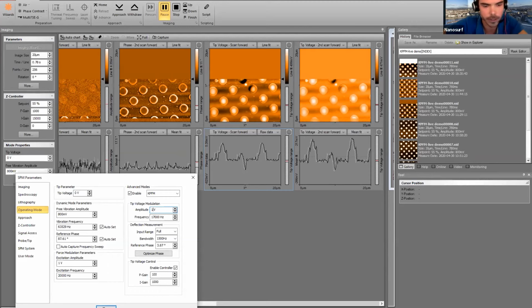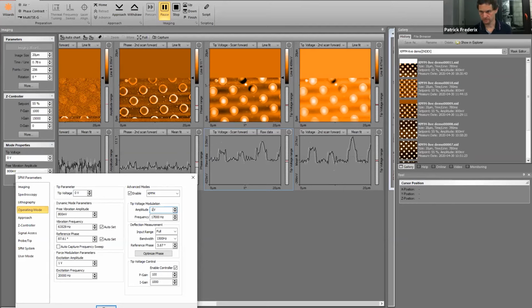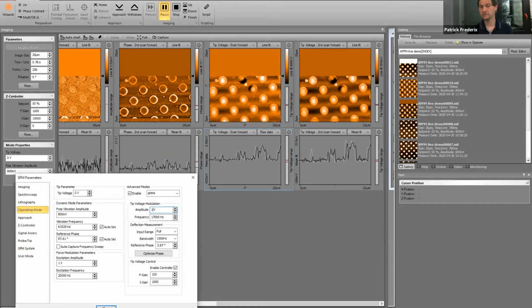And then the next question, can you get the work function from the KPFM measurement? That's a good question. It's an often asked question, and in theory, yes. In practice, it's cumbersome. To get the work function of a material, you need clean surfaces. We are working here in ambient, and in ambient, there is always a water layer on top. There can always be some oxidation, there can be contaminations, and these influence the measured contact potential difference between the tip and the sample.